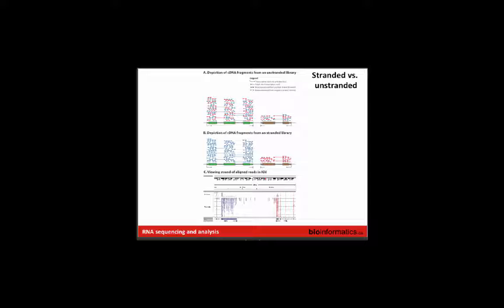But now with the strand-specific libraries, you actually get that information being encoded. And we're going to visualize some RNA-seq library. If you activate the right view in a genome viewer like IGV, it'll tell you how each read was tagged, so basically what strand the read believes it came from. And those will, again, be colored blue and red. You can see that they work out pretty consistently: the reads colored blue tend to correspond to a transcript that was being transcribed in this direction, and the reads colored red seem to be overlapping perfectly with a transcript that was transcribed in the other direction.